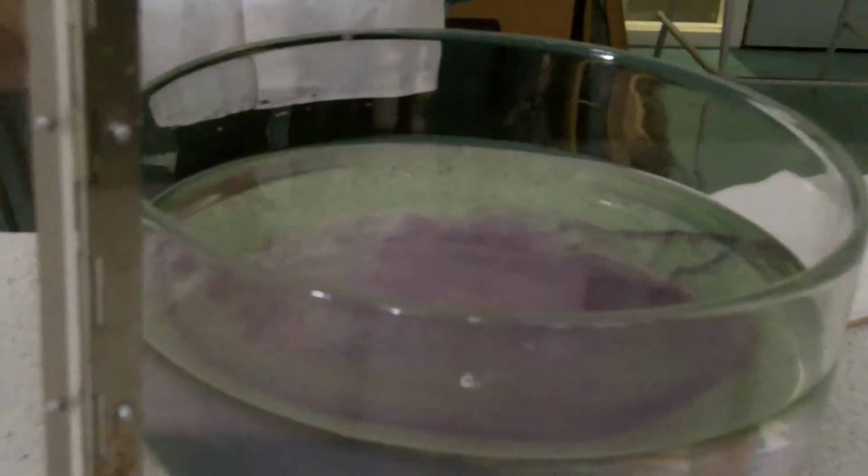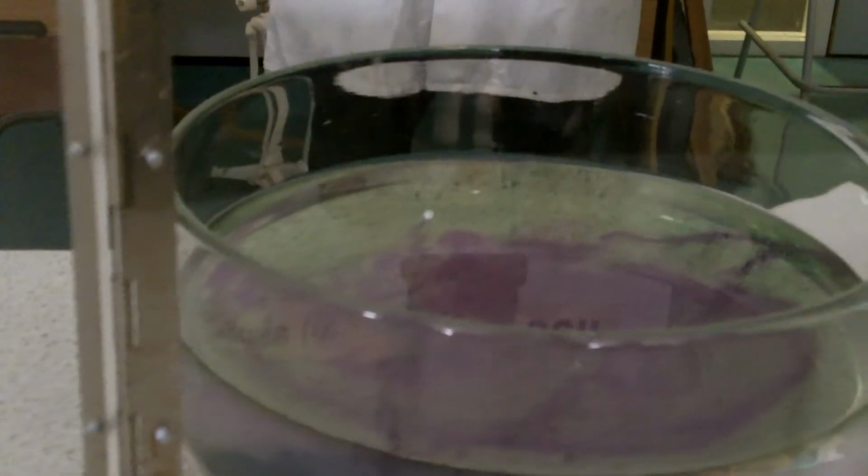Bit of steam coming off as well. Really exothermic. Lots of heat given off. It's turned into a ball. That's right, it sort of reacts. It starts to spin with the gas as the gas gets produced. It's actually skidding across the water. It's sitting on a bed of gas as it's reacting with the water, producing the gas. Pretty much like a hovercraft. So it's fleeing across the water at the moment.